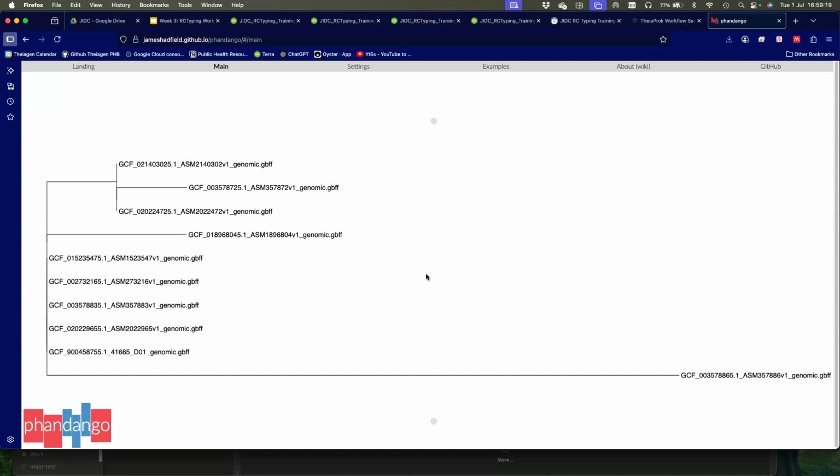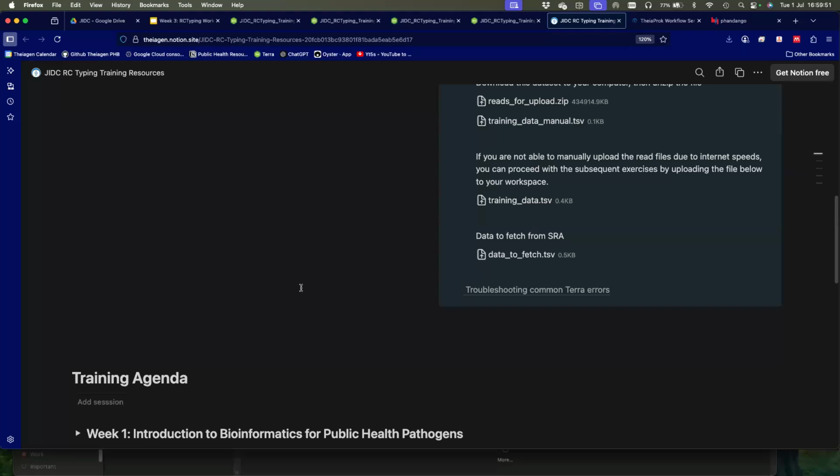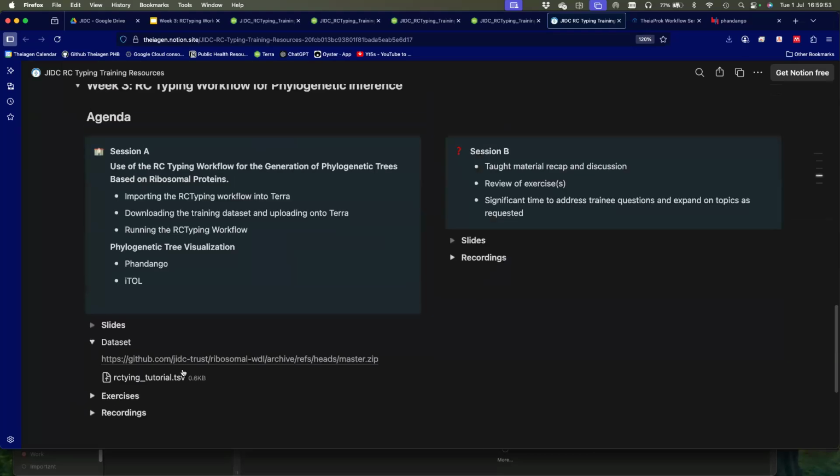So, James, hi James. Yeah, hi. So on Thursday, we'll be going over the same, trying to implement or doing an exercise on the RC typing ourselves on Thursday. Yes, we do RC typing using this. So what I would like you to do is try using the data set that you download from week 3 here.